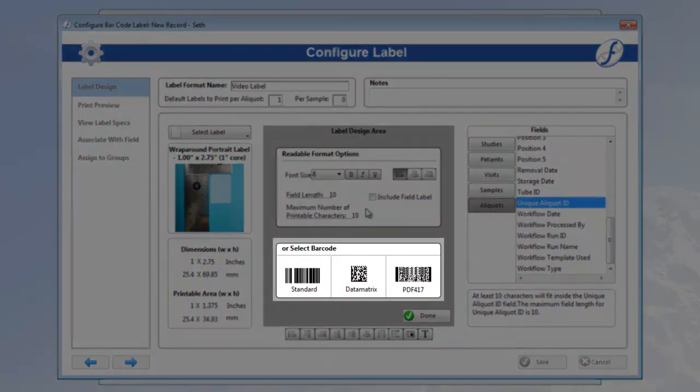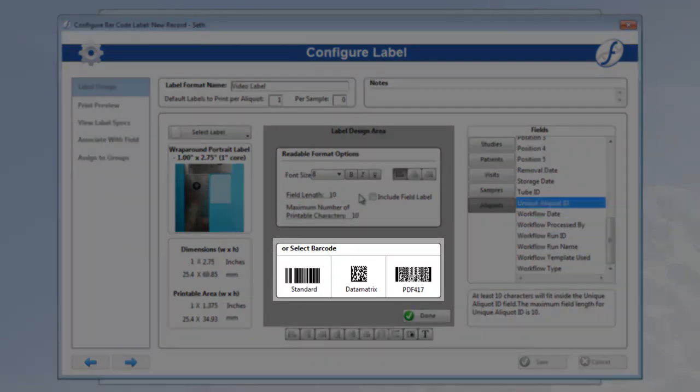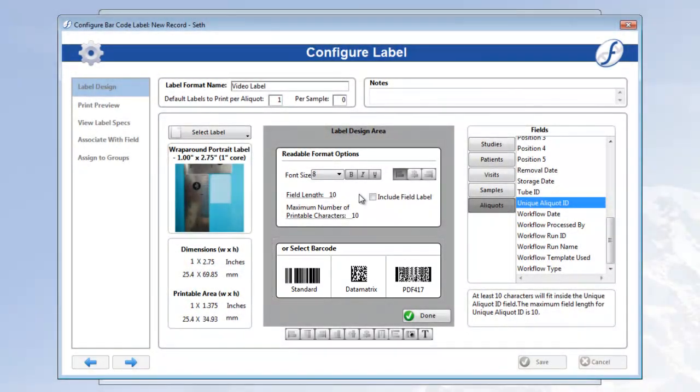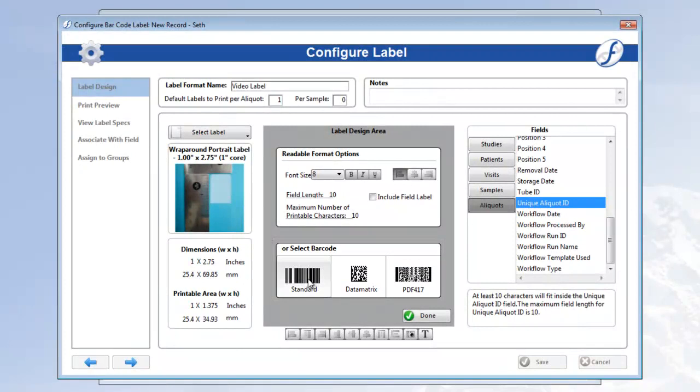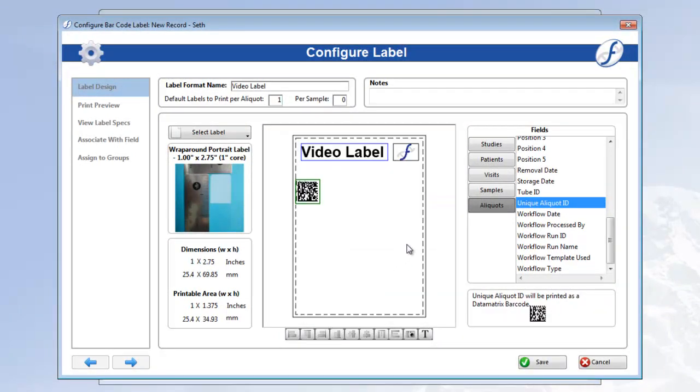Standard, data matrix, or PDF417. We suggest most users choose the data matrix, as it holds more data in less space, allowing you more room for additional information. After clicking the barcode button, the label format will reappear with the data matrix barcode for a unique aliquot ID, now in the place I dragged it to.